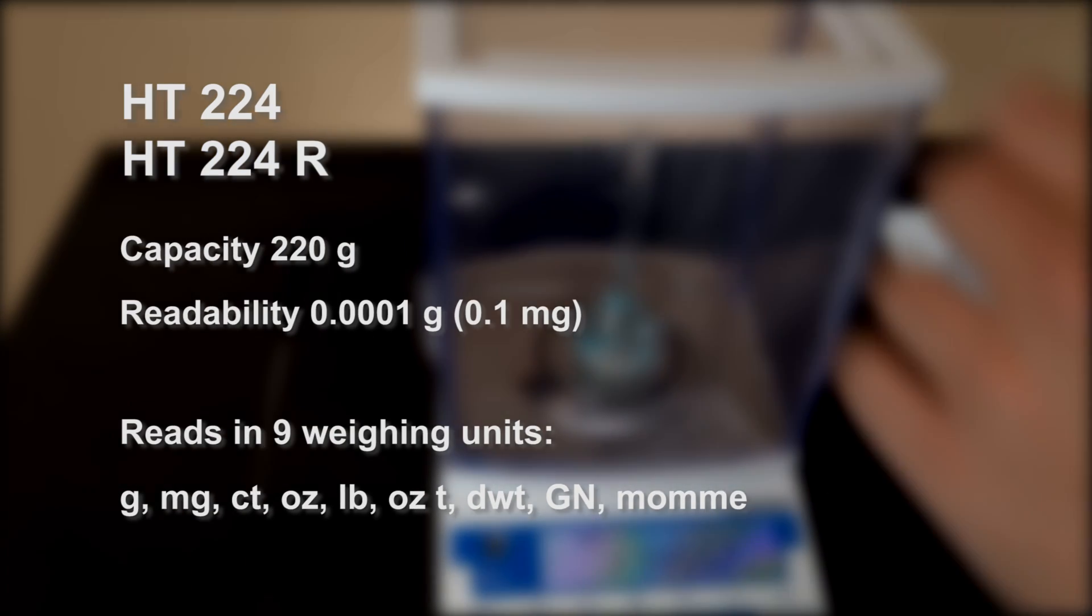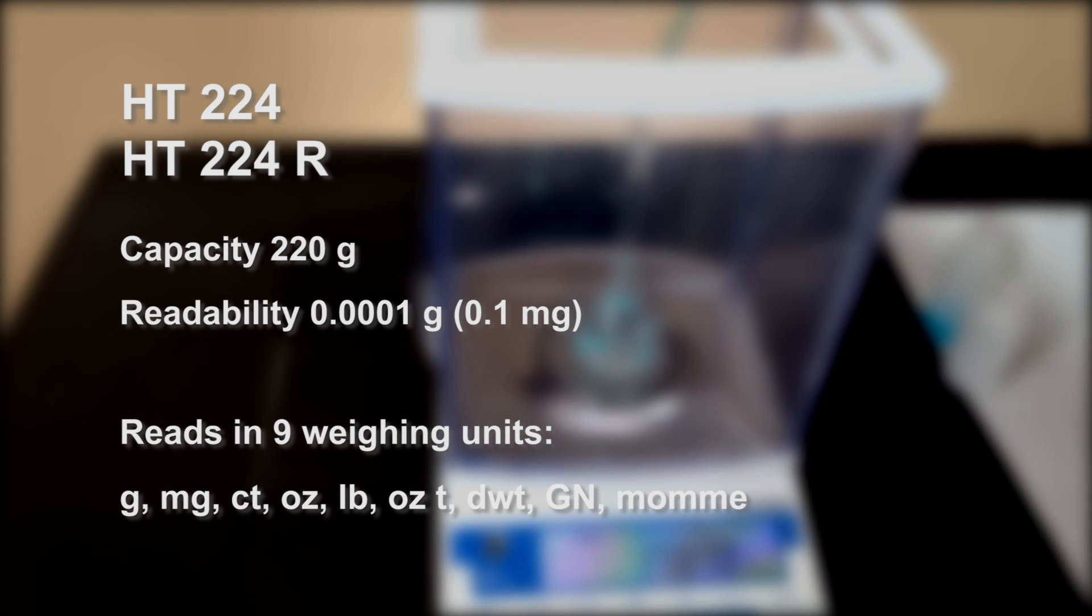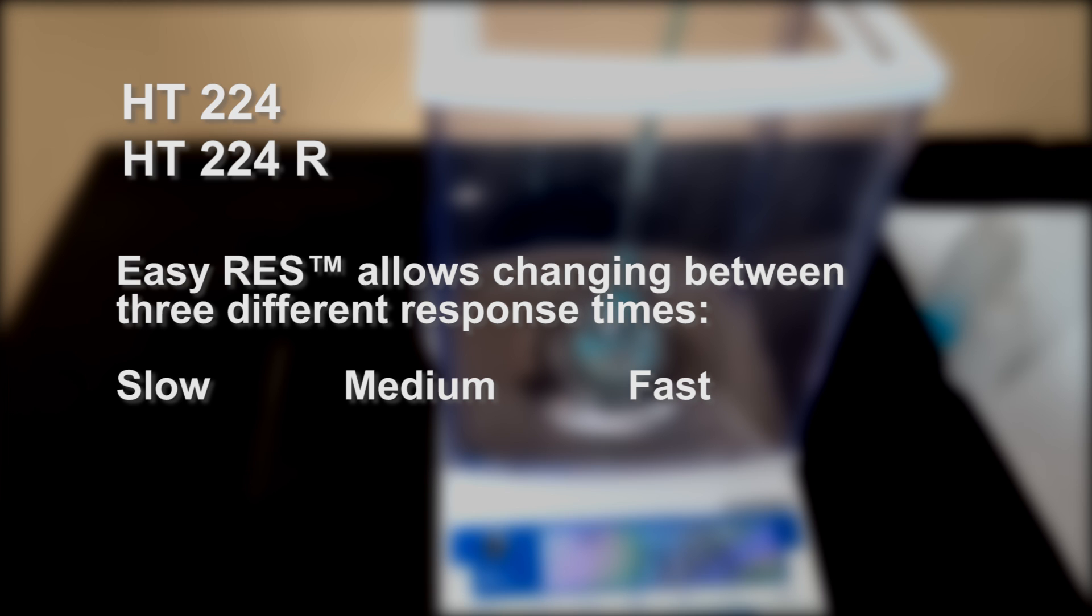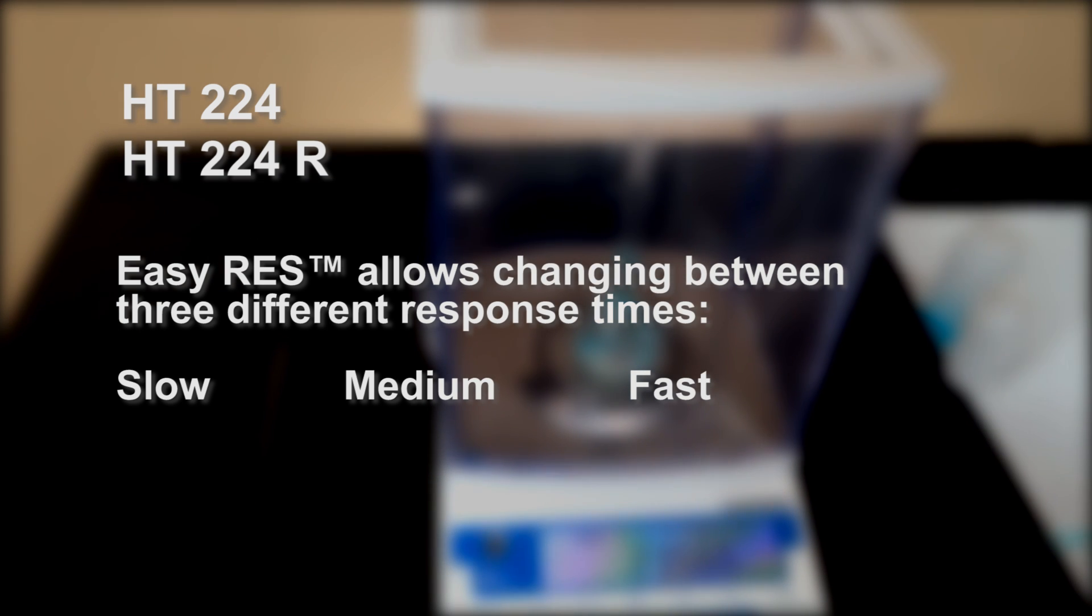The HT224R provides analytical weighing at 0.1 milligrams and reads in nine weighing units. EasyRes allows you to change between three response times to suit your application.